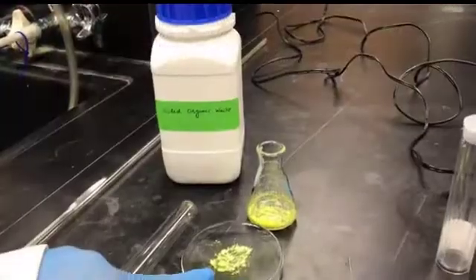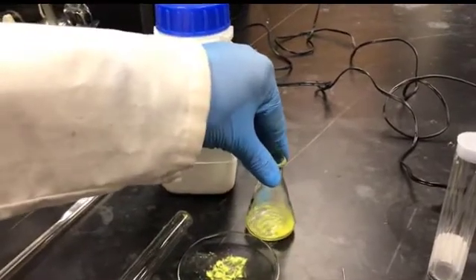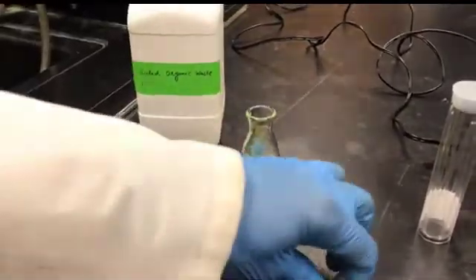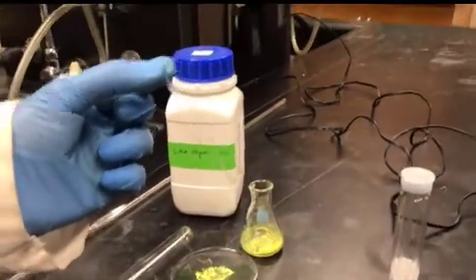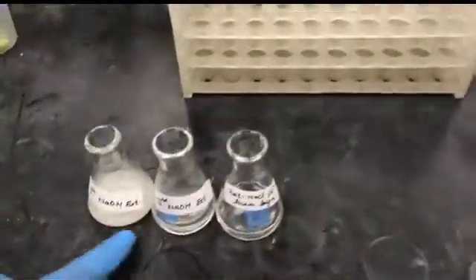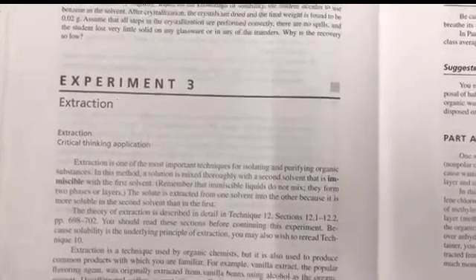You are going to dispose of this waste, which I've used to prepare the melting point tube, into the solid organic waste, and this one you are going to put in the recovered bottle. You will find a recovered bottle and put it there. Basically this is a capillary tube. The used melting point tube will go to the glass trash. These three aqueous extracts I'm going to dispose of in the aqueous waste. That's all in this experiment number 3, extraction. Thank you.